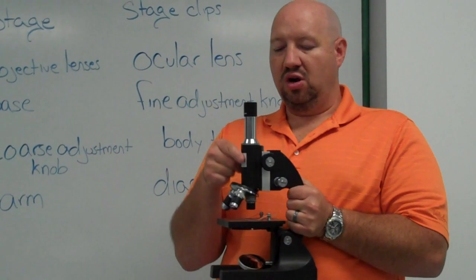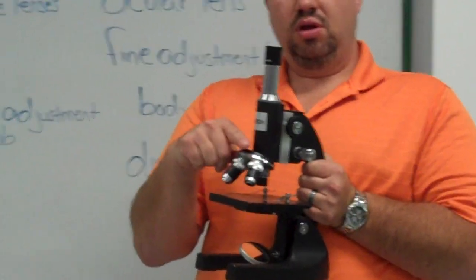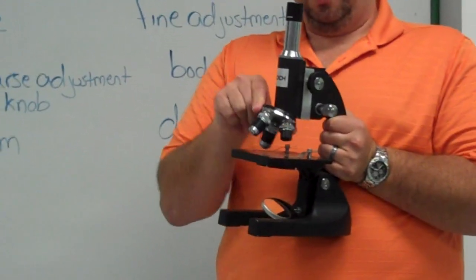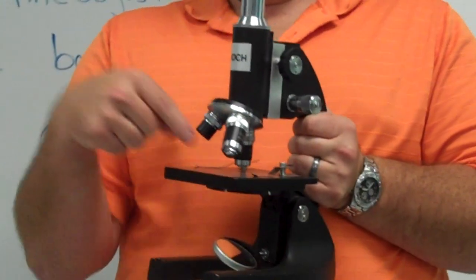Then you have this part here called the body tube. The part that jets out is known as the nose piece and that's where you're able to turn. And you turn these three lenses.